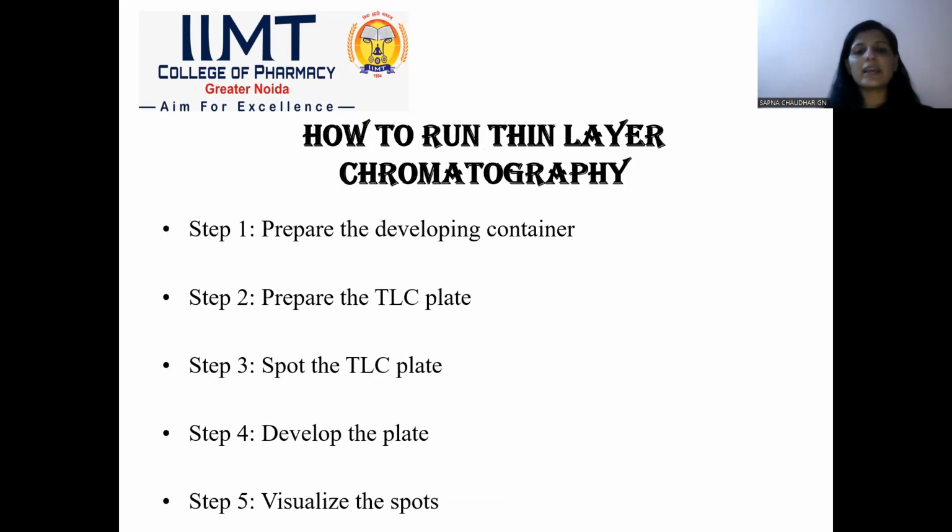How to run the thin layer chromatographic technique? First, prepare the developing container. Next, prepare the TLC plates. Next, spot the TLC plate. Next, develop the plate. Fifth, visualize the spots. First is the preparation of the developing container.